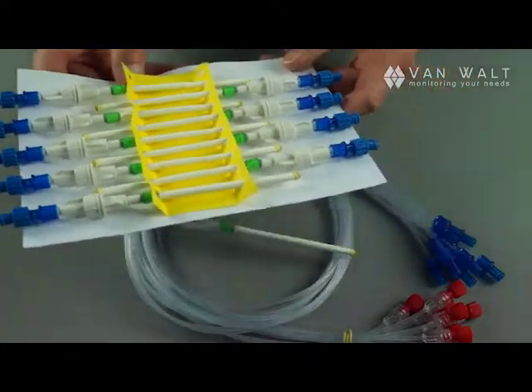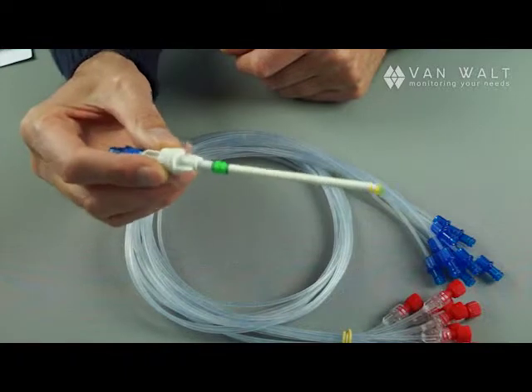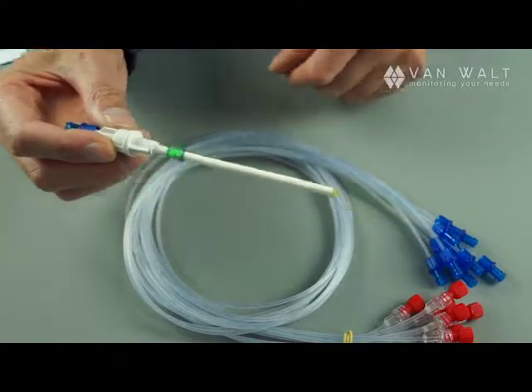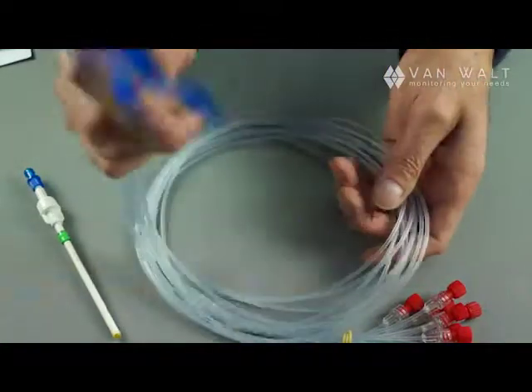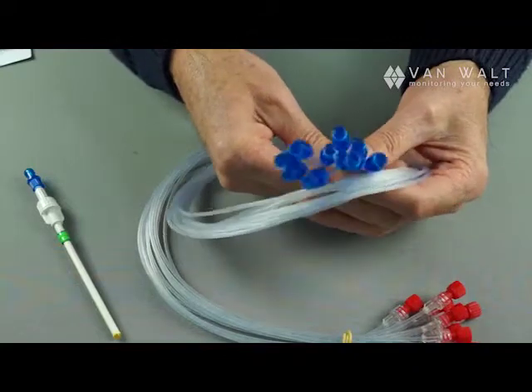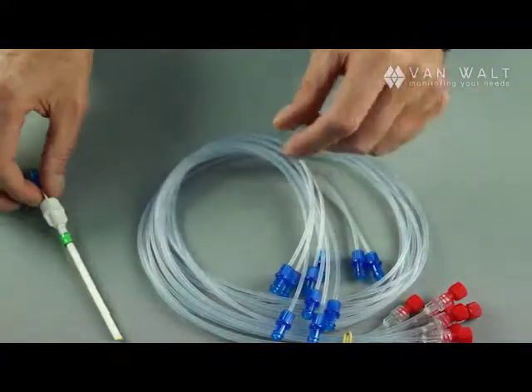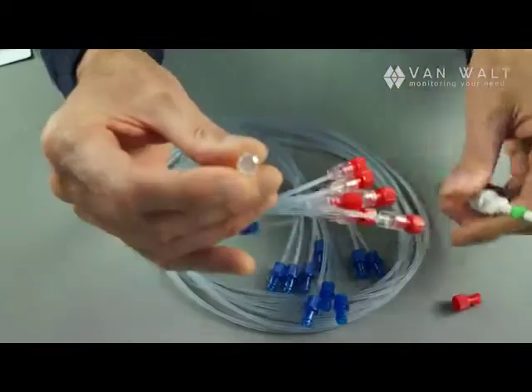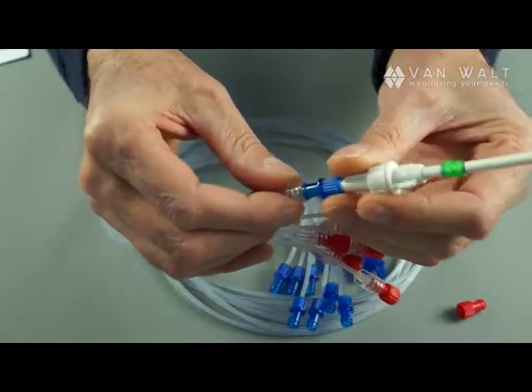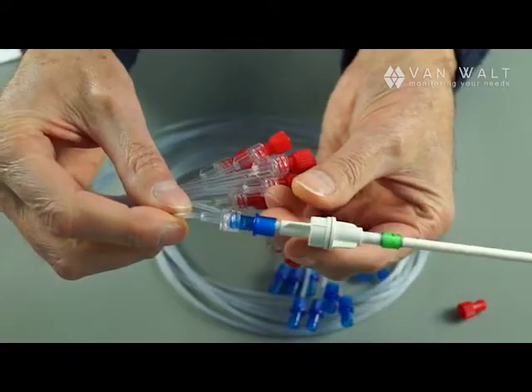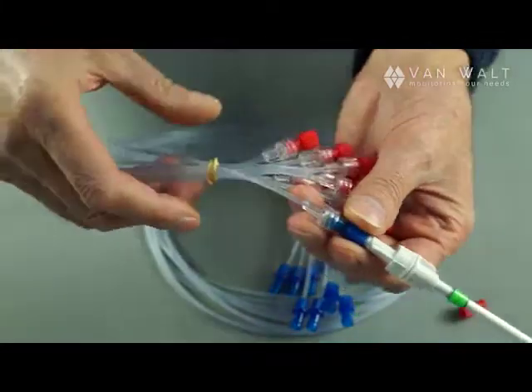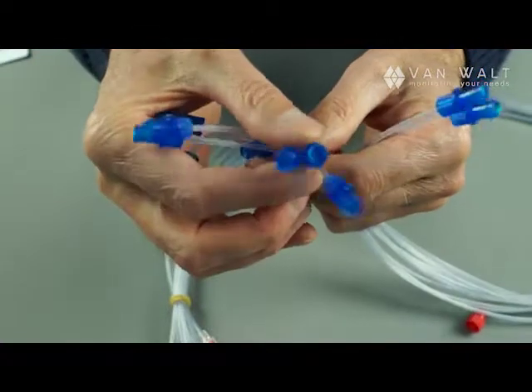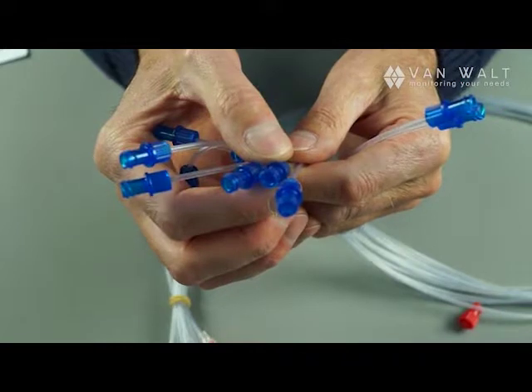For the macro rhizomes in particular it may be that you wish to deploy them rather deeper than just the 10 centimeters or so, in which case you can purchase separately extension tubes. These are typical extension tubes, in this case they are one meter length. It works quite simply: you connect on one side of the extension tube the female connector to the macro rhizome. That is deployed in the soil, that is buried, and the extension tube terminates at the top in a male connector to which you can connect your vacuum tube or syringe.